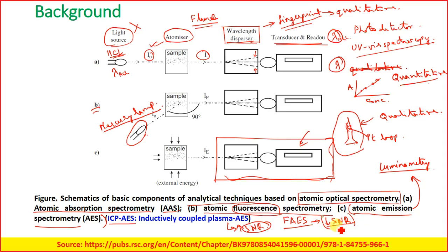But anyway, there is a saying that you get what you pay for. So if you do not have a large amount of money to get an ICP AES, you design your own AES. It may be a flame AES, but it can help you in the preliminary understanding of the process you will be doing. Okay. So over here, do you have any question?